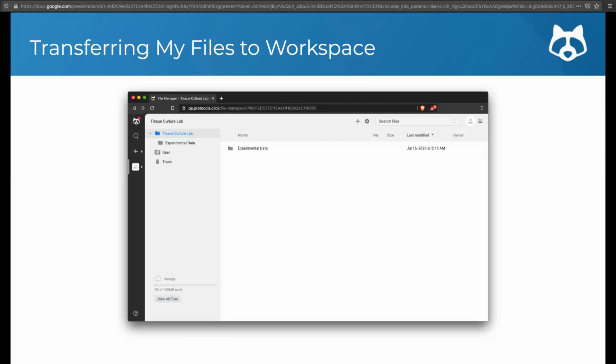Now, one thing that a lot of people might not be aware of is that we have an invite feature that allows you, on non-premium accounts, to invite users to the protocols.io platform. And for every person that you invite, you increase that limit on how many private protocols you can have in your workspace. So if you do need a couple extra protocols, but you don't need to go full on premium and you want to stick to a free account, you can invite a couple new members to the protocols.io platform. And if they sign up, you get free protocols. So I can make sure that we post that link in the show notes.